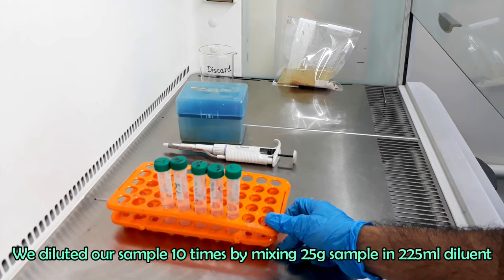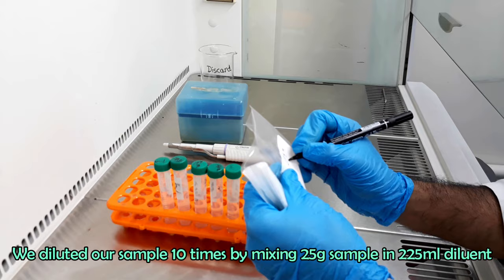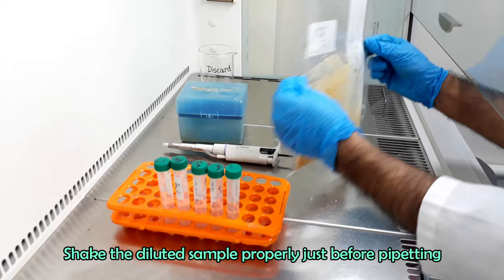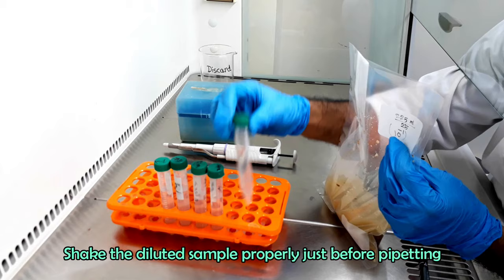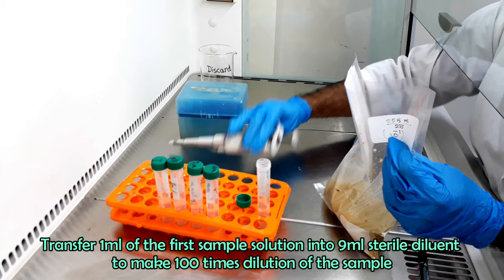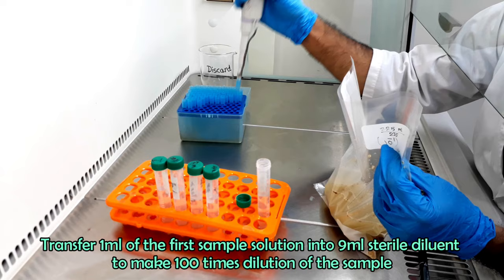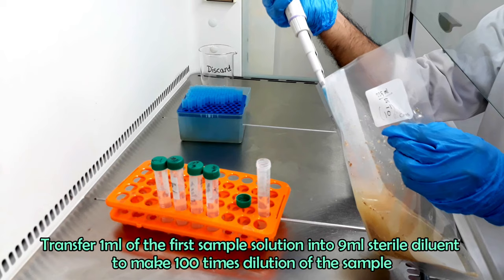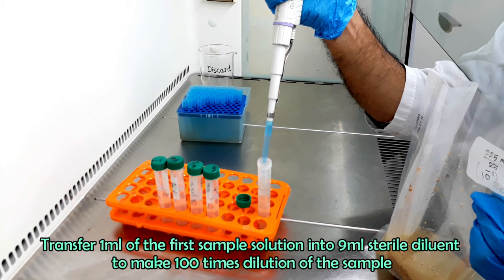At first, we diluted our sample 10 times by mixing 25 grams raw sample with 225 ml diluent. That's why we are labeling the first sample solution with 10 inverse 1. Now transfer 1 ml of the first sample solution into 9 ml sterile diluent to make 100 times dilution of the sample. This dilution is called 10 inverse 2.